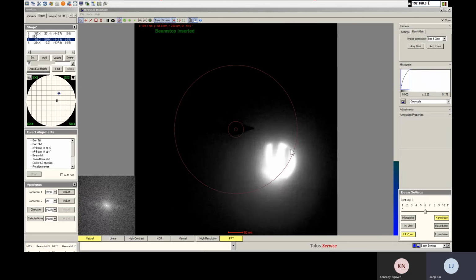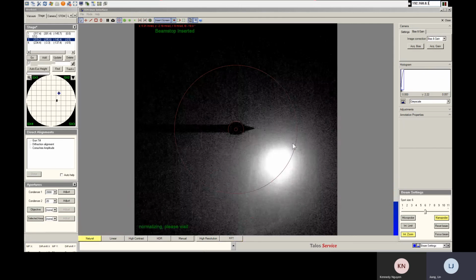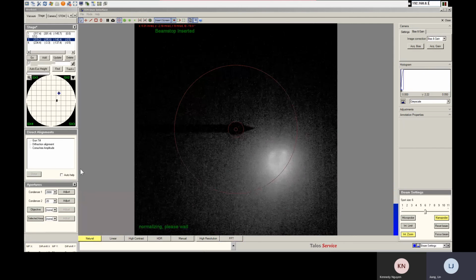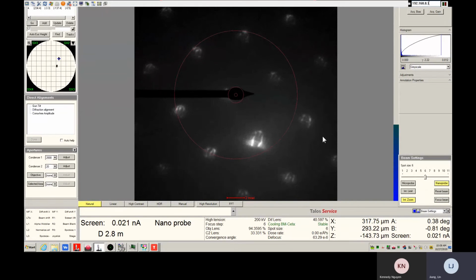Select this region. Select this region. Then switch to diffraction. Okay, let me see.